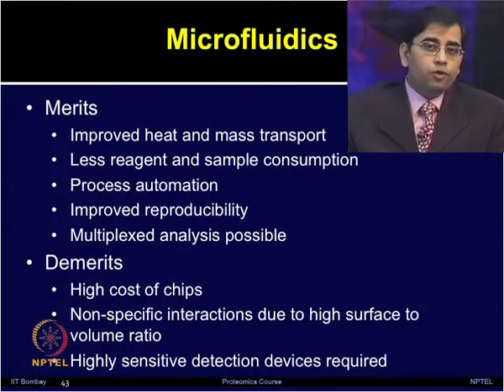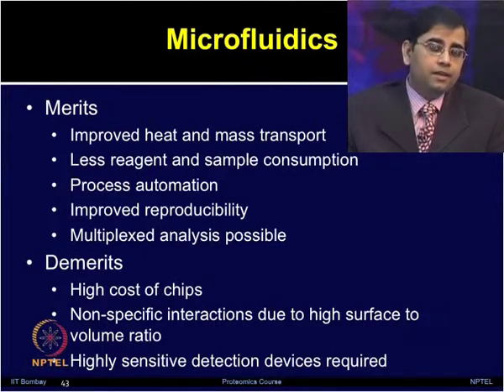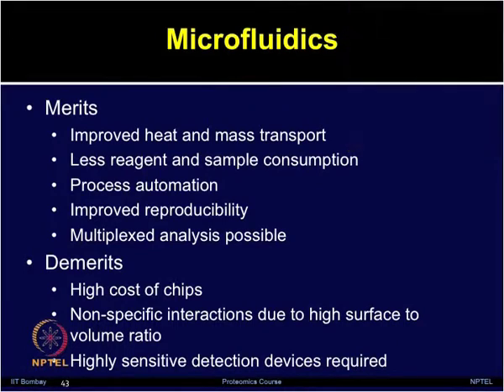The demerits of microfluidics include the higher cost of the chips. Sometimes non-specific interactions occur due to the higher surface to volume ratios, and highly sensitive detection therefore is still needed, and more research is ongoing in this area by using microfluidics.